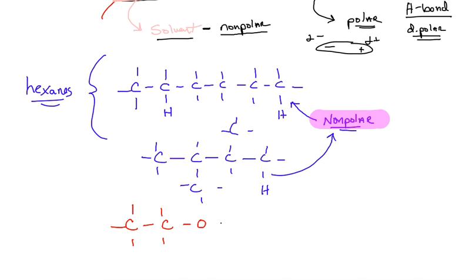And then we're going to have the acetate, from acetic acid, if you remember, which looks something like this. So we're going to push these together, and what you're going to get is a carbon double bonded here, and then your CH3. The bottom line here, whether you know the structure or not, is that ethyl acetate is an ester, and esters are aromatic, and you could probably guess they have some level of what? Polarity. So there is some polar behavior.